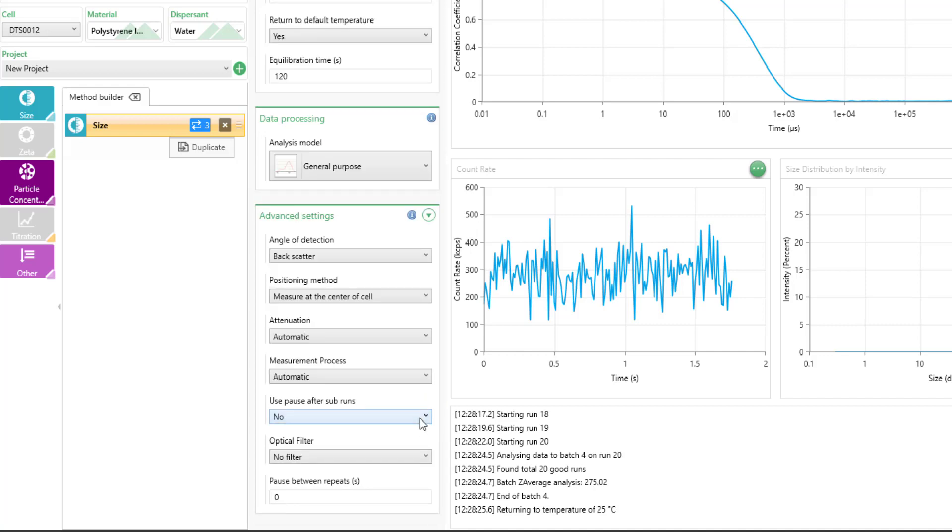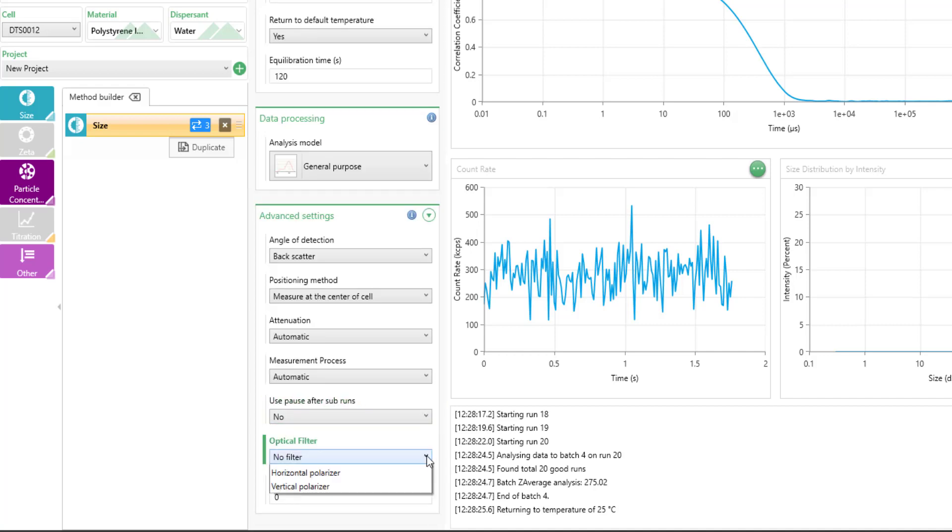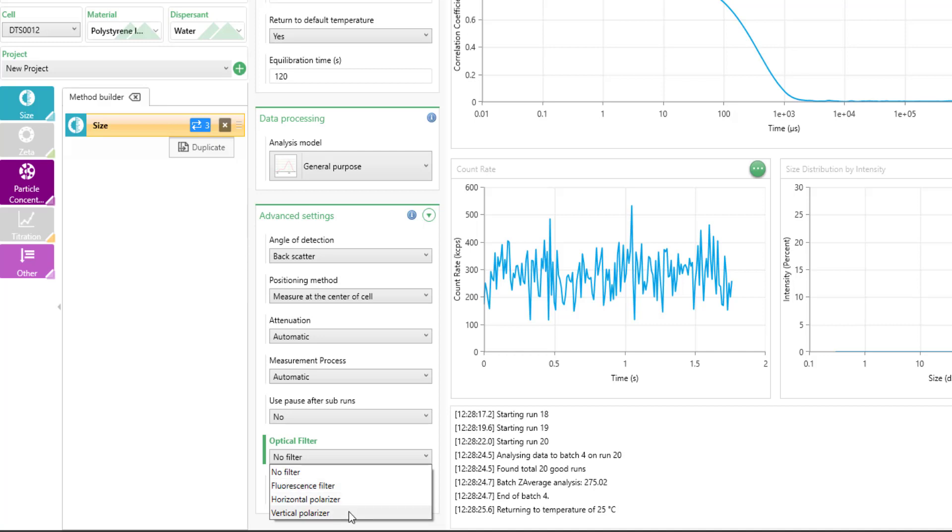You can insert a pause after your sub runs or you can use an optical filter. You have three different options here with both the pro and ultra model, a fluorescence filter, horizontal polarizer, and vertical polarizer.